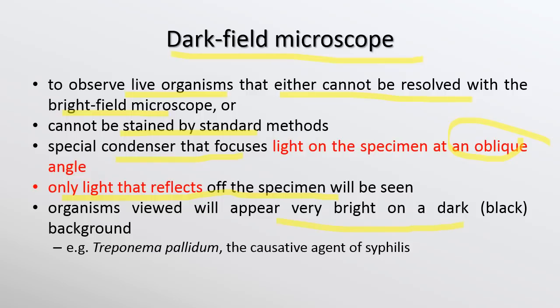The background is usually black, and it is very often used in the clinical setting for the detection of Treponema pallidum, which is the causative agent of syphilis.